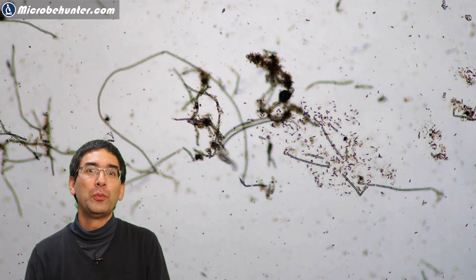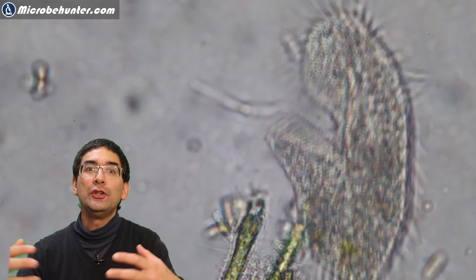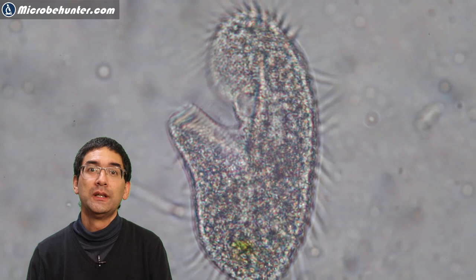which is covered with cilia, and it has a pretty large oral groove because the way that they eat food is by actually collecting debris and bacteria and ingesting them. And I think that this part that's standing away actually helps them catch some of those microorganisms.